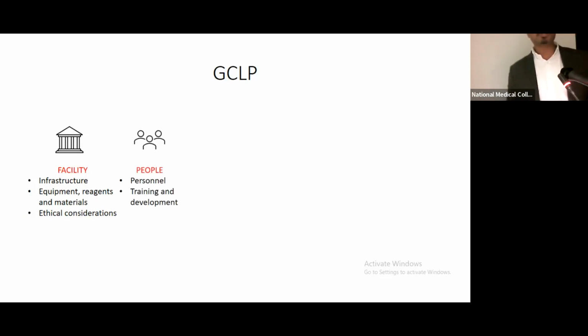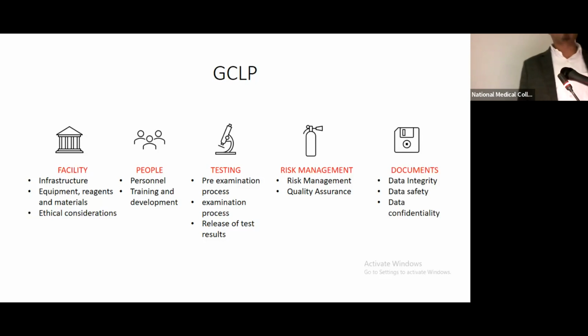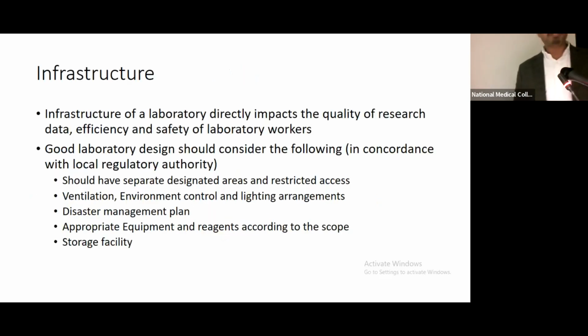And also it is associated with the people who are doing the testing and their constant training and development. And also what is the process involved in the testing, whether it is pre-examination or during the examination of the test results or while reporting it. And also the risk involved to the participant, to the performer, and to the environment. And how the documents are stored, shared, and confidentiality is maintained.